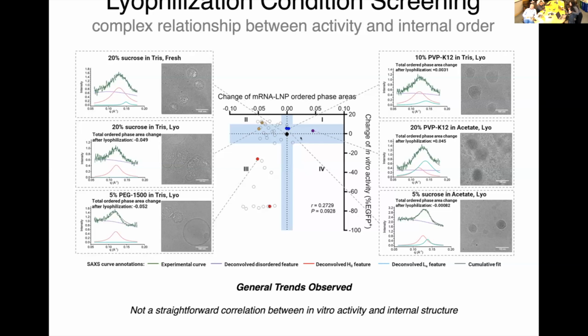And so we see that there are a lot of different changes in the activity after lyophilization, and it's not super clear how the conditions are really correlated with the change in activity and also the change of structure. So that's definitely something that we want to look at more. Okay. Yeah, but structure-wise, that peak disappears. Yeah, that was very interesting.